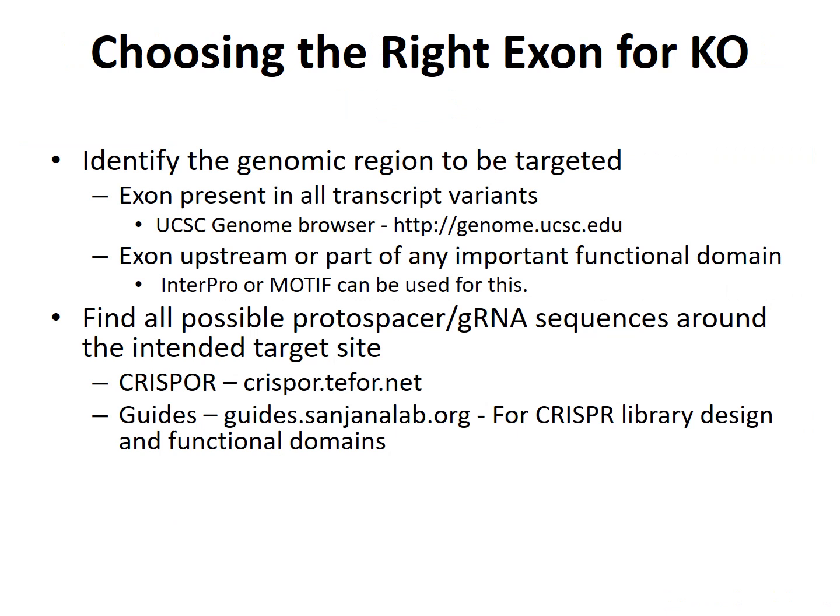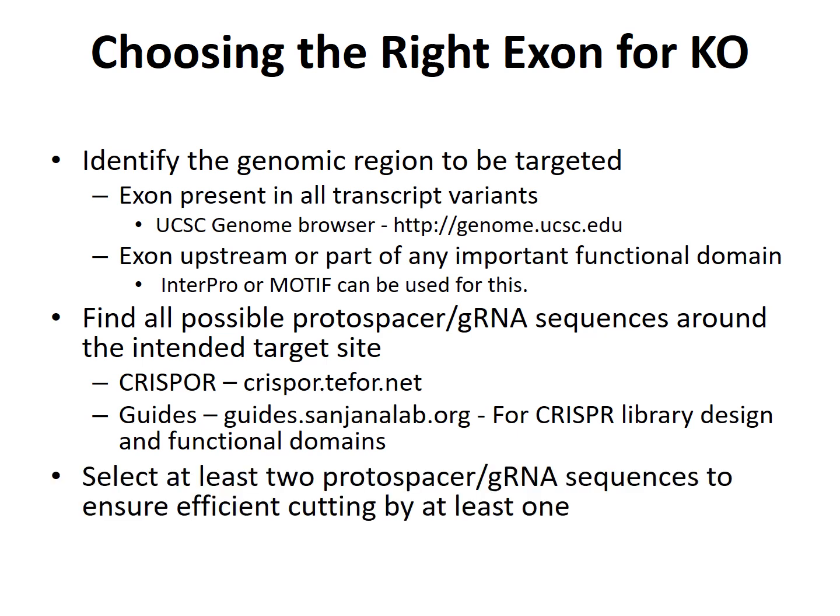So again, just a reminder, find all the protospacer or guide RNAs around your intended target site. And then finally, as Branden mentioned earlier, you want to select multiple protospacer or guide RNA sequences to ensure that you get efficient cutting by at least one of them.